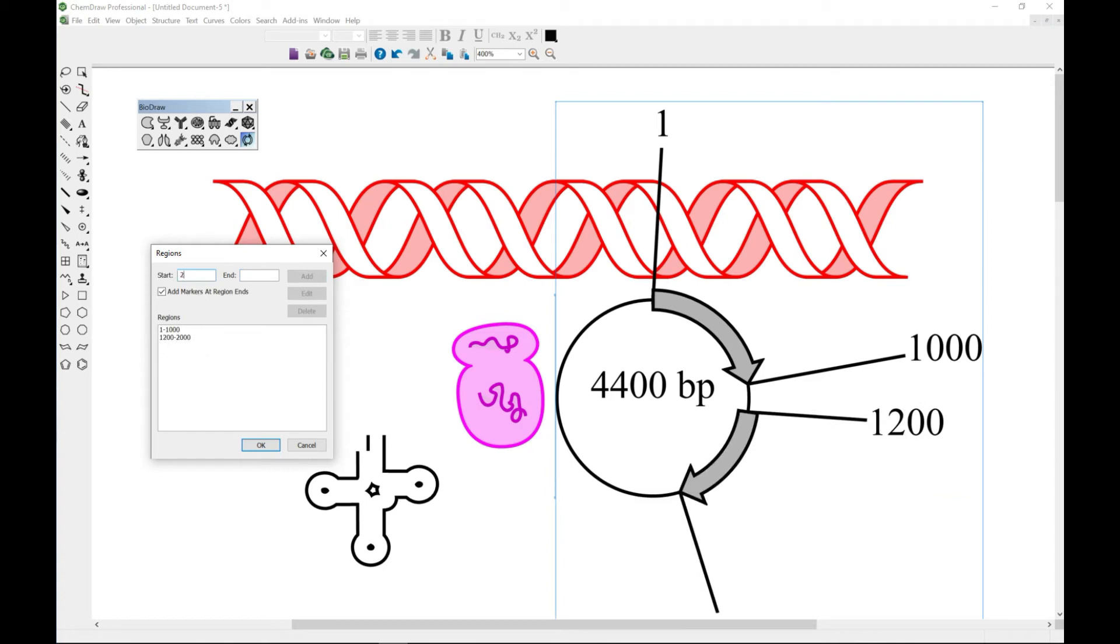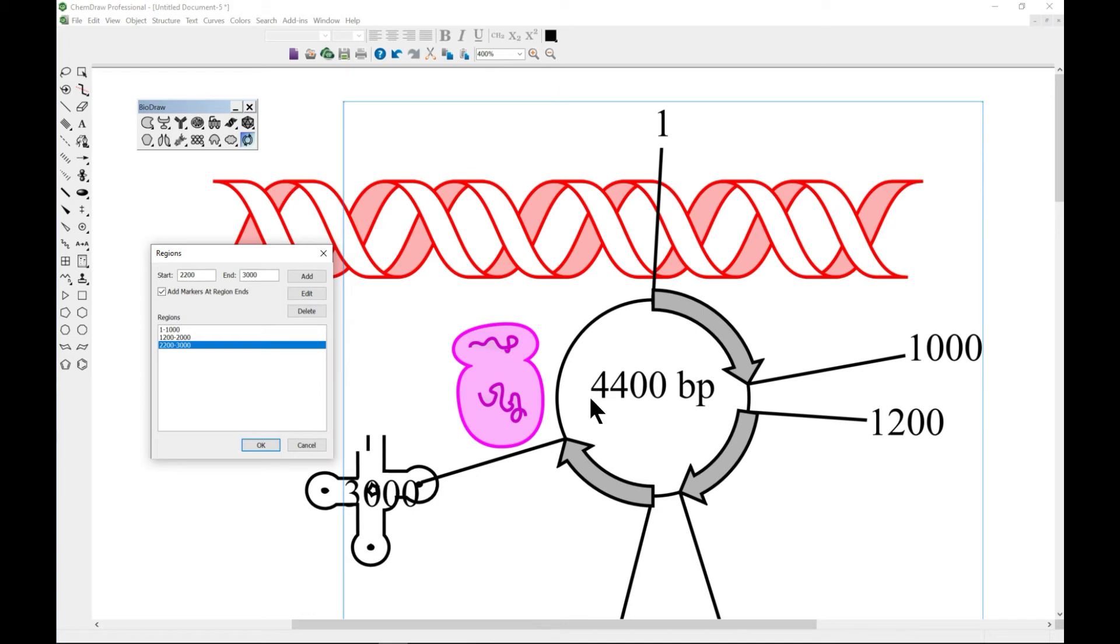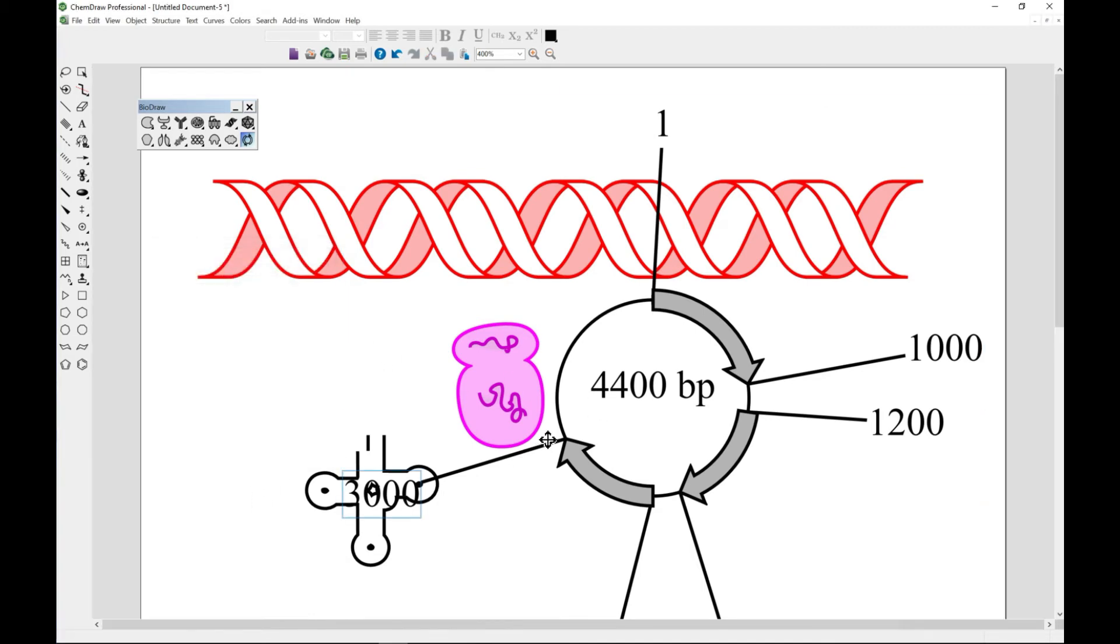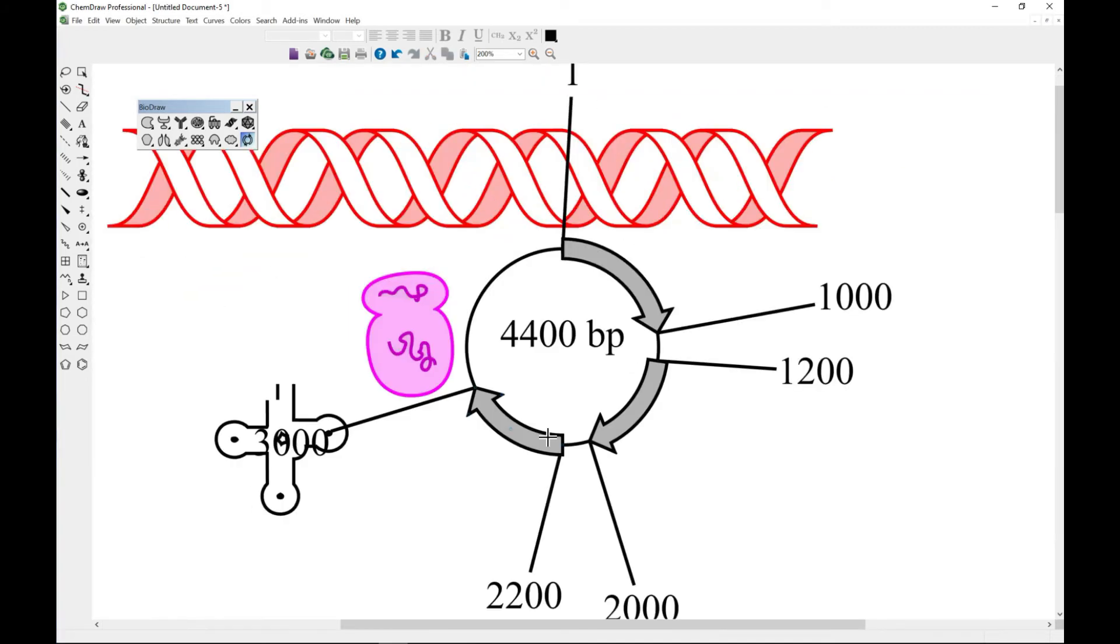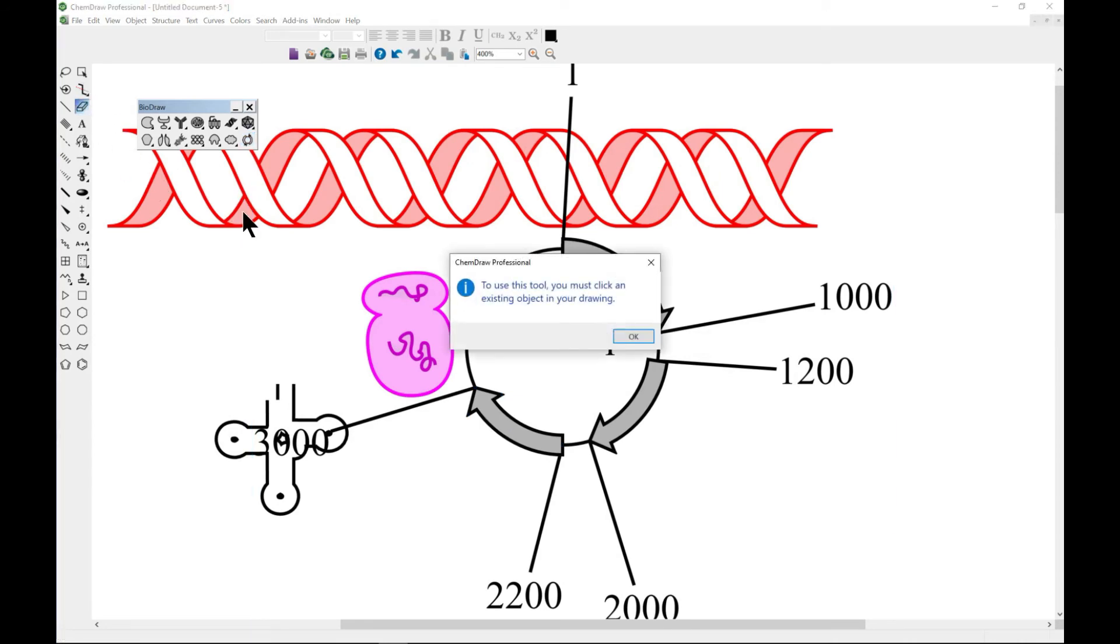Let's say 2200 to 3000 and go to add. If for some reason you don't need it, you can just select and go to delete as well, and hit OK and you have this.